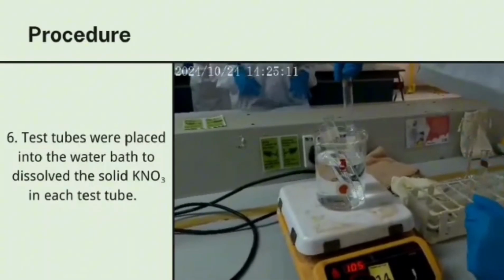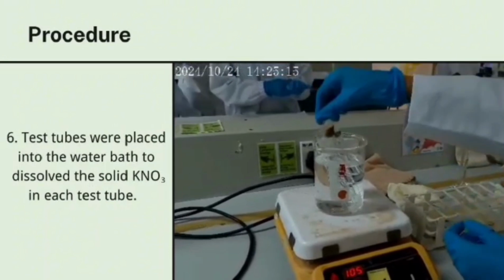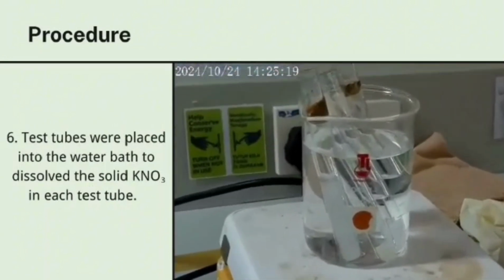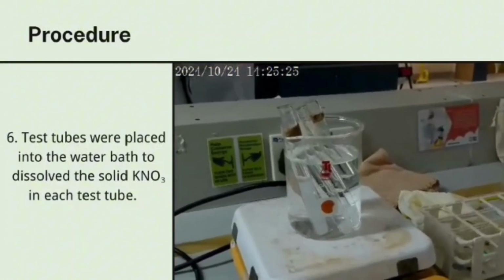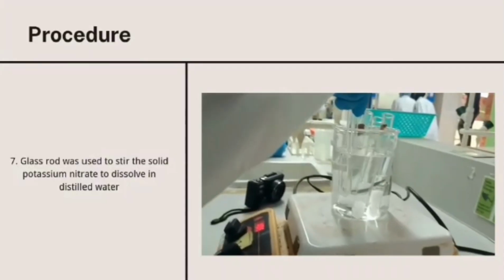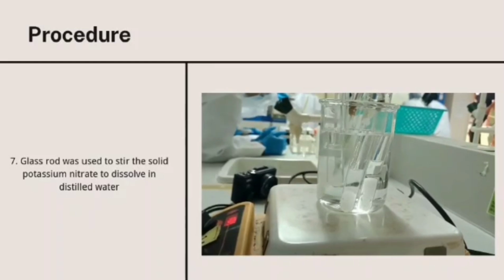Procedure 6. The test tubes were placed into the water bath to dissolve the solid KNO3 in each test tube. Procedure 7. A glass rod was used to stir the solid potassium nitrate to dissolve it in the distilled water.